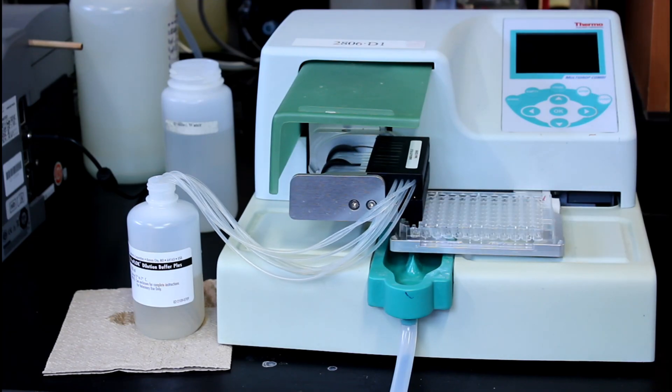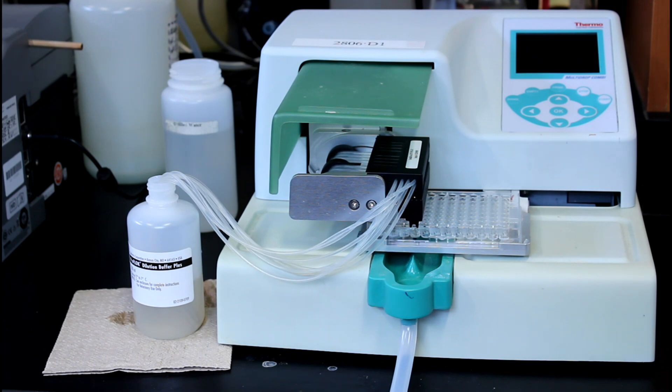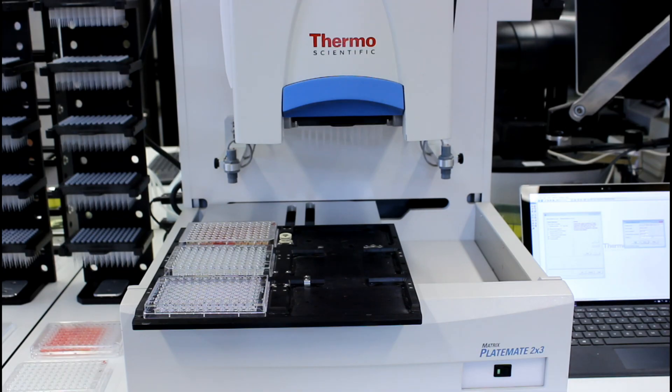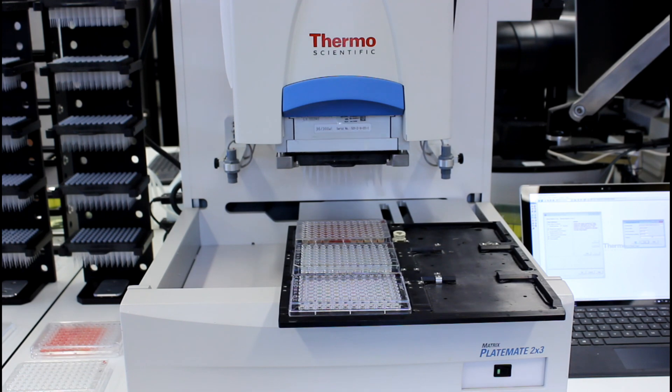Let's move on to molecular techniques. Featured here are some of our high-throughput equipment to process ELISA testing. These machines allow us to process multiple runs of different types of tests in high numbers, which comes in handy to avoid batch testing and also during outbreaks.